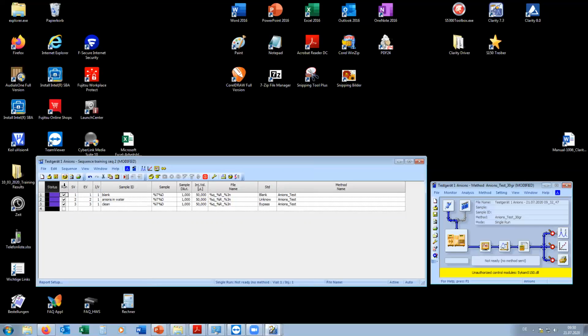So I show you what happens if I start my sequence. Let's see if everything is connected, because there will be flow here. I have to put it like this. Okay, so I start my sequence with this switch.